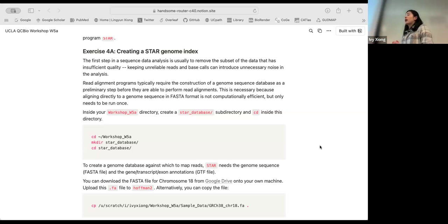So today we want to index a chunk of the human genome together so that you will know how to do that. For the whole human genome, of course, it's going to take a bit longer, so today is more for exercise purposes. And we use these index files to do our sequence alignment.